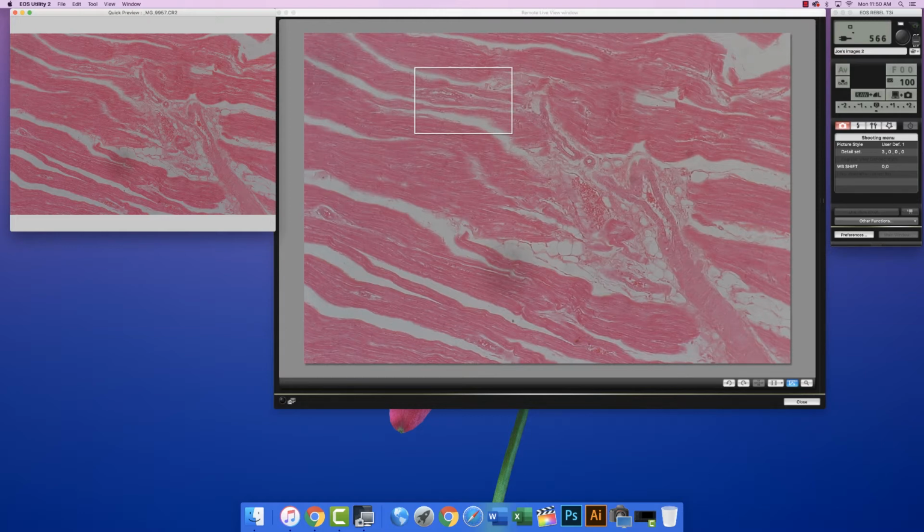So you need to take a look at your final image to know exactly what was captured when you pushed the button. And I would say that the real image is a little bit darker and a little bit more contrasty than this live view image. This image is 9957.